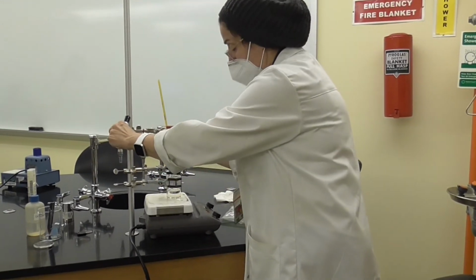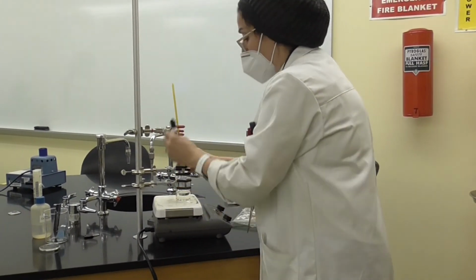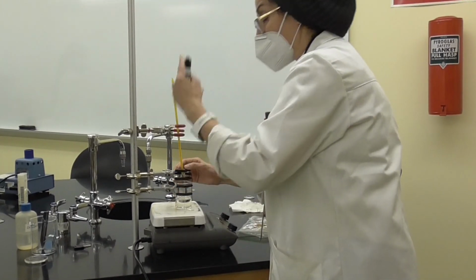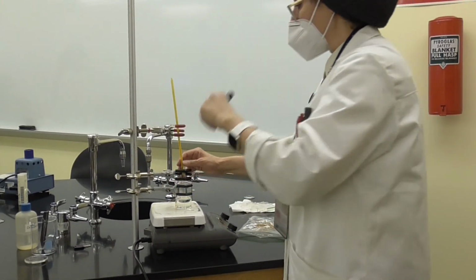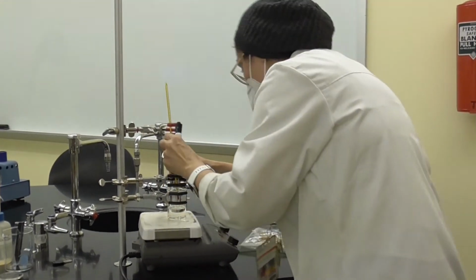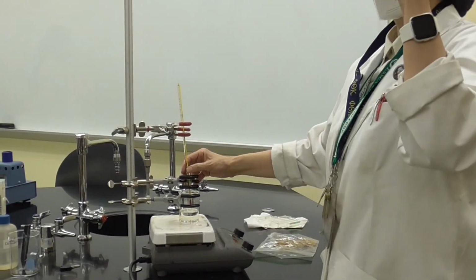And over here, if you look at the thermometer, it should not touch the inner wall of that test tube, and it is going to go all the way to about 1 centimeter above your liquid.